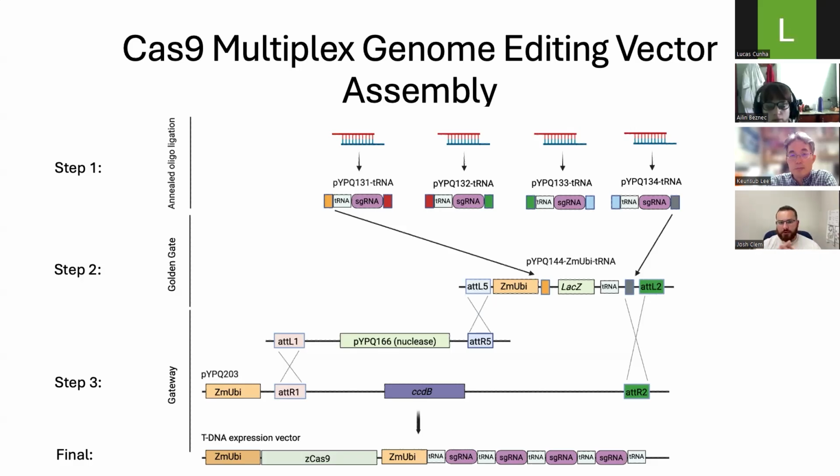Now, I personally am experienced using a type 1 CRISPR system in which we use Csy4 as part of the Cascade, because it forms a complex upon genome editing. And I express Csy4 as part of that complex. It's also Cas6. They're interchangeable, Cas6 and Csy4. I don't experience any toxicity in expressing that cassette in rice, at least. I don't use it for guide RNA processing, but that would be at least some evidence that it's not toxic in rice.